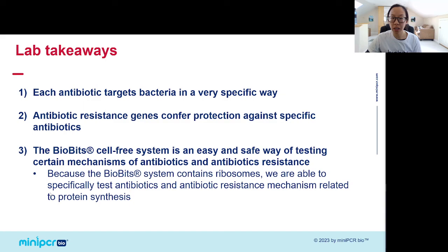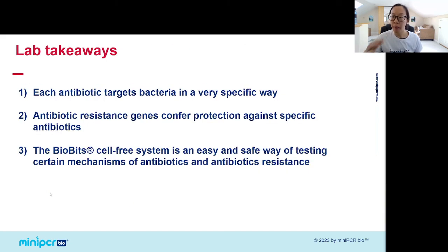So that is our antibiotics lab, our BioBits antibiotic resistance lab, how it's done, and the important takeaways that I'm showing here from the lab.